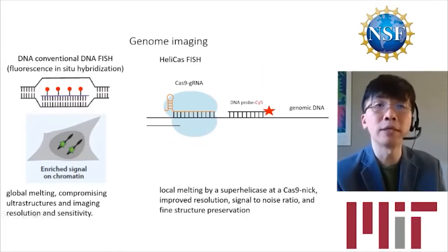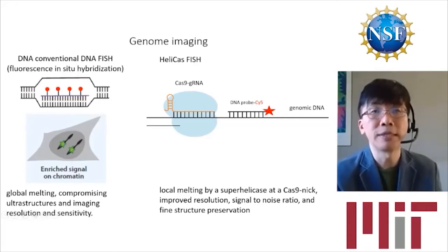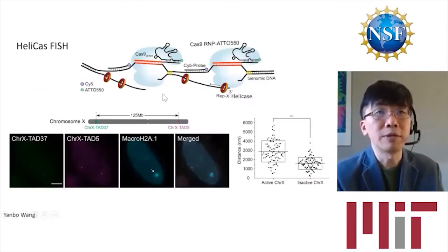So this way, you can get local melting, not global melting, giving rise to a much better signal-to-noise ratio, potentially preserving the fine structures better because you don't melt the DNA globally, and higher resolution. So this is the scheme again. We make a nick and the helicase gets loaded, unwinding the DNA to expose the binding site for the FISH probes.